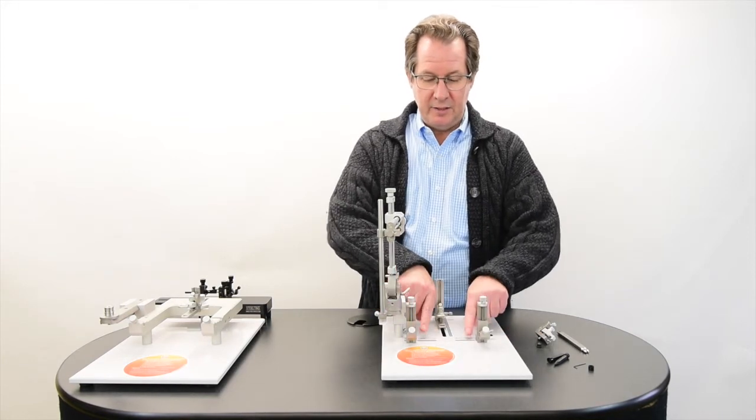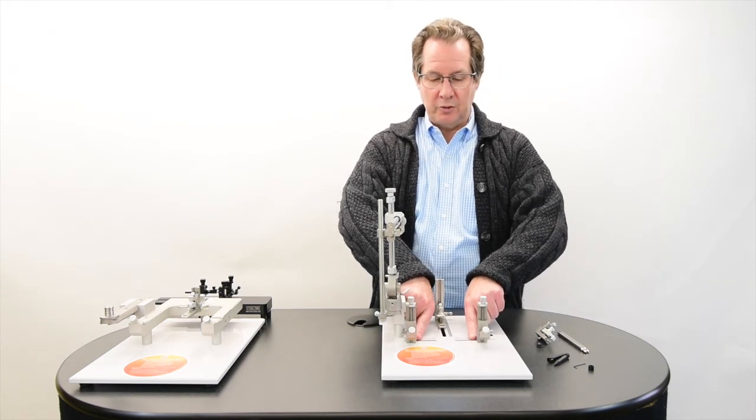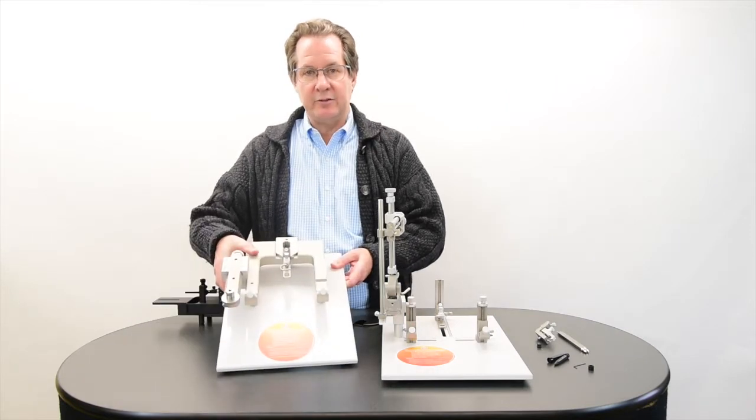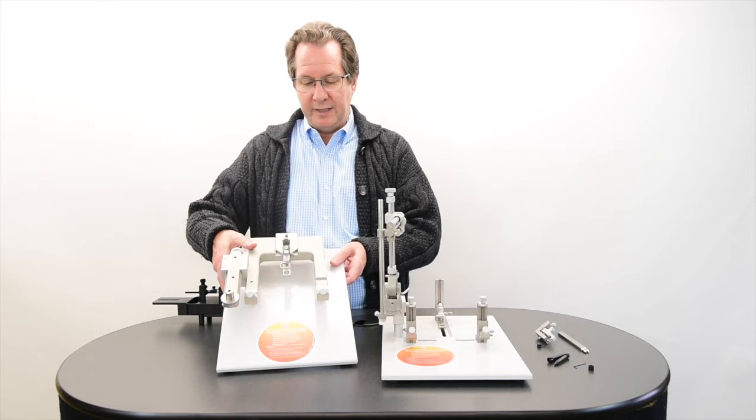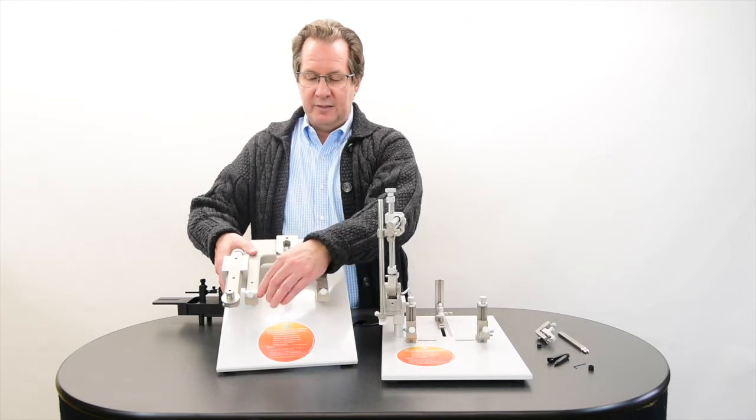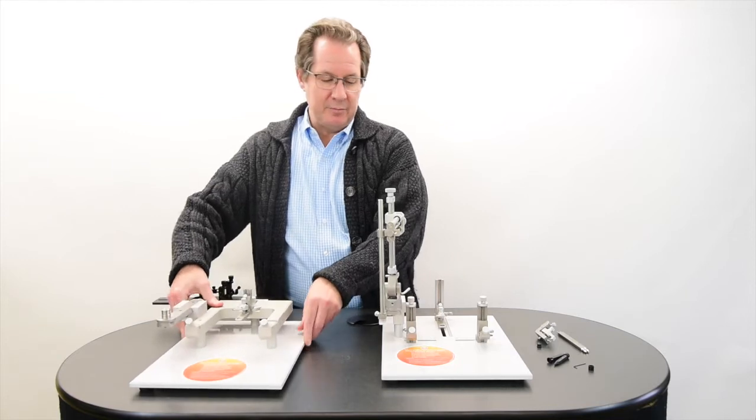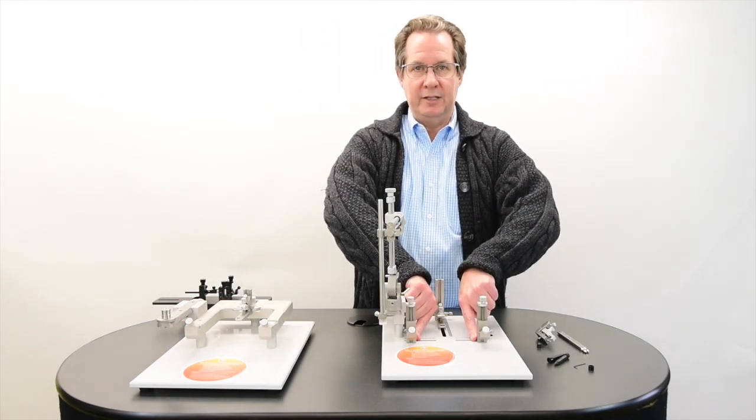Those vertical posts all the way to the side are very similar to what you may have seen in other stereotaxic instruments. This is the more traditional u-frame or what we call our lab standard series. This distance between this u-frame will be the exact same distance when these vertical posts are all the way out to the edge.